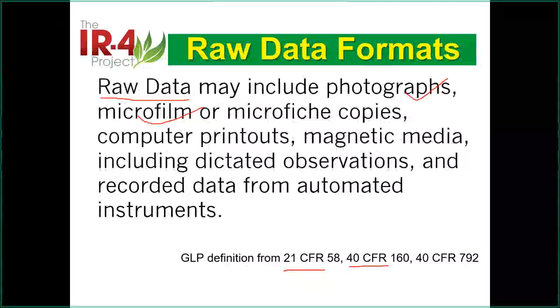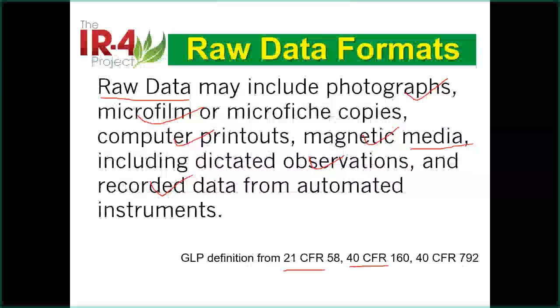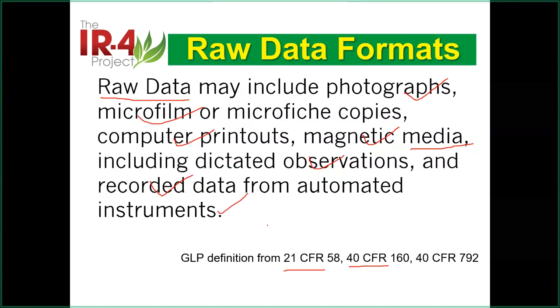All those computer printouts, all those magnetic media. So that's a big area, the electronic data. Everything related to observation, recording, and automated systems. Even this definition of raw data and electronic data from 50 years ago is still valid nowadays.